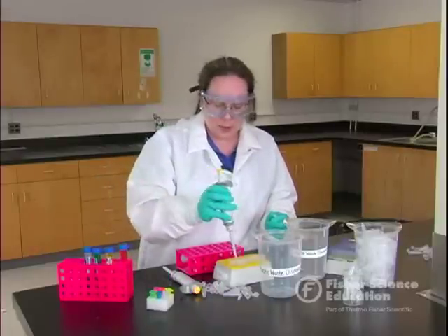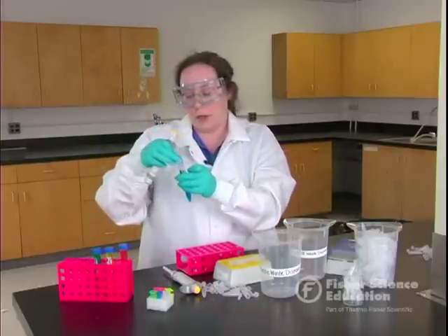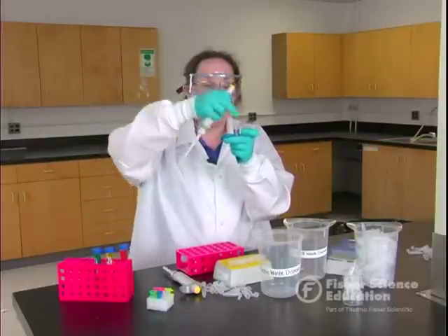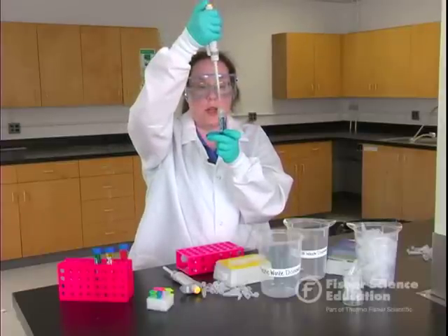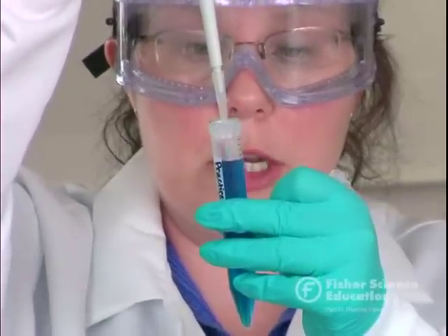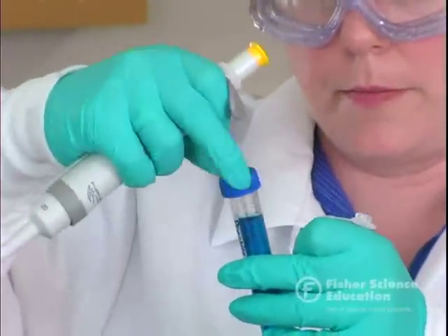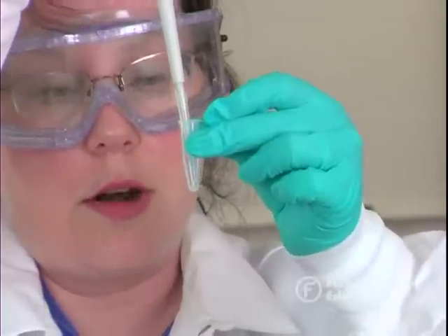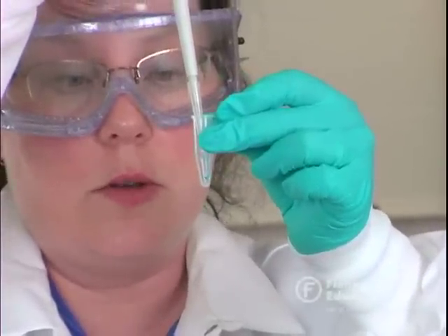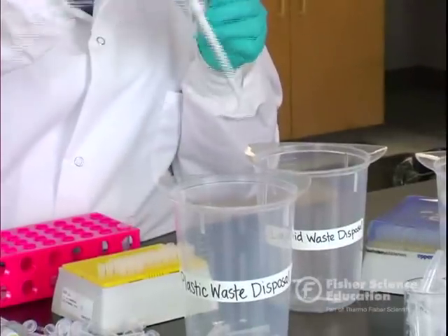One common problem is that students, because they're trained to touch the tube when they dispense, will also try to touch the walls of the tube when they're drawing sample. We have to train students to make sure that when they're getting sample, they're right in the middle, not touching the walls. Because of the cohesive and adhesive properties of water, you want to draw sample from the middle with the tip just under the surface, keeping the pipette as vertical as possible. When dispensing, touch the side of the tube, go to the first stop then the second stop, keep your thumb pressed down, then release and dispose of your tip.